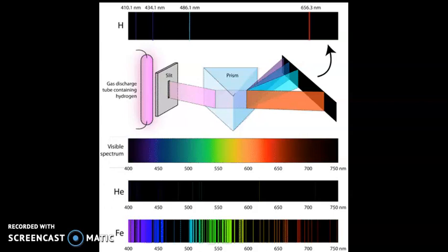Now, after every single discharge tube, I'm going to show you not only what we actually see in lab, but then also what the official spectrum actually looks like. And that's what that image is actually called. You can see the one for hydrogen up at the top showing 4 distinct lines, not something that we would call a continuous spectrum, which would be every single color of the rainbow without stopping. This has very distinct areas of blackness on the inside of it, showing only 4 distinct colors.